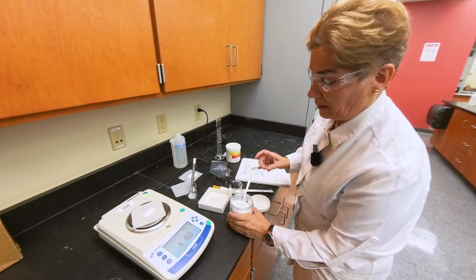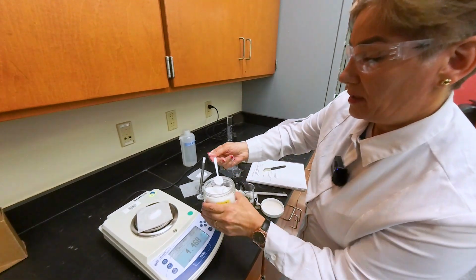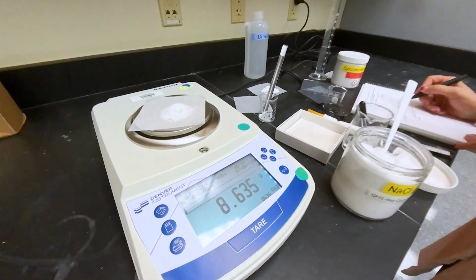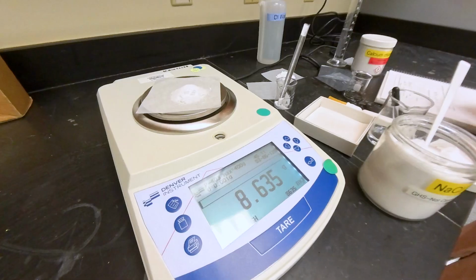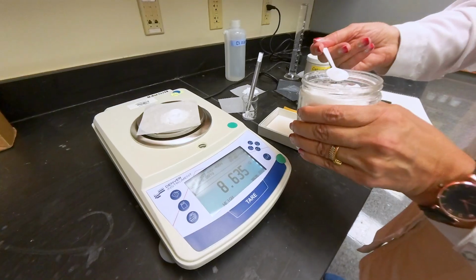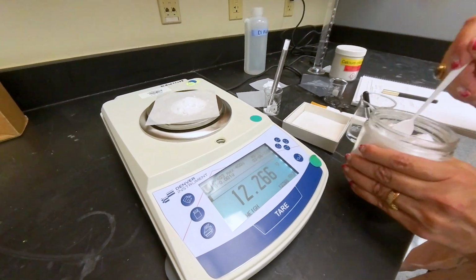Then adding a second spoon of the salt, I record the mass after the second spoon. And since it's asking for 1, 2, and 3 spoon, I add the third spoon of the salt and record the mass.